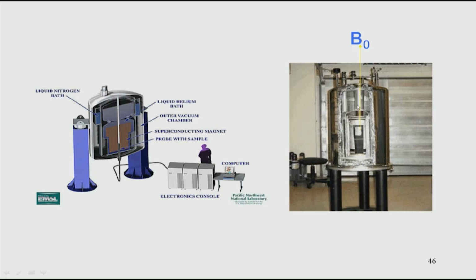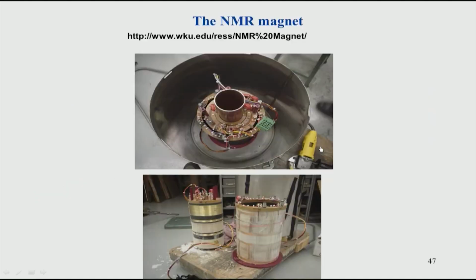If you look at the interior, you can see different layers of the magnet, one inside the other. In the middle you can see the bore, and this hole runs from the top of the magnet to the bottom. You can see the coil surrounding this bore. We will look more closely at this coil in the next slide.